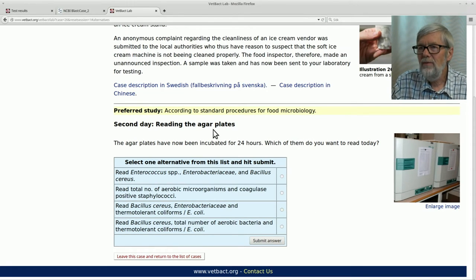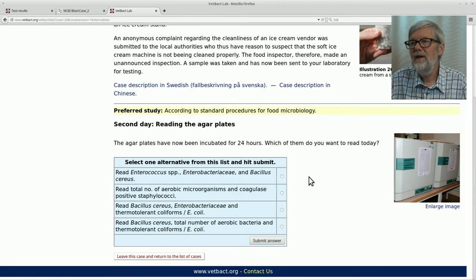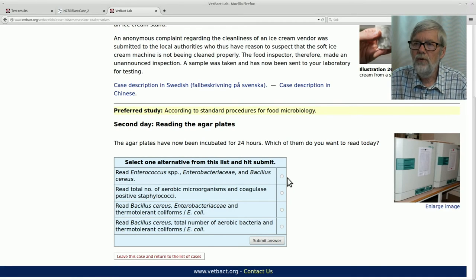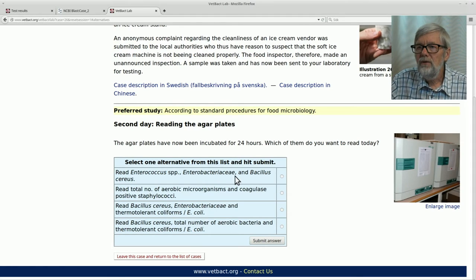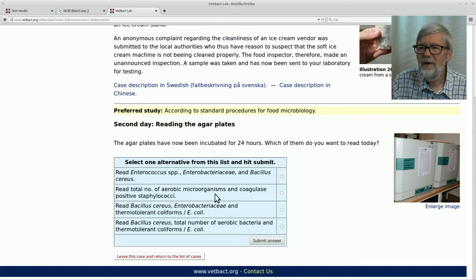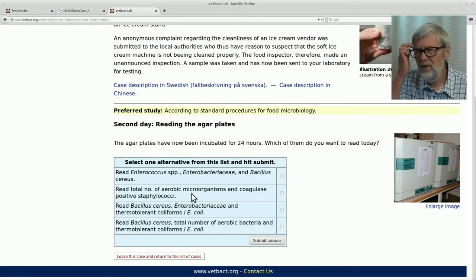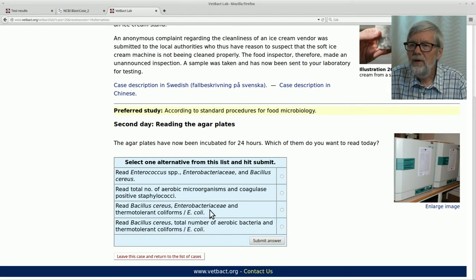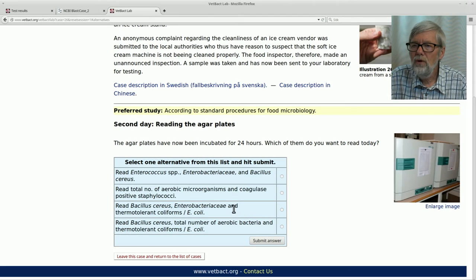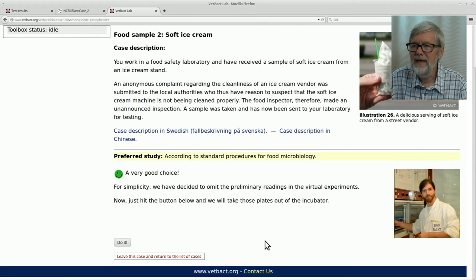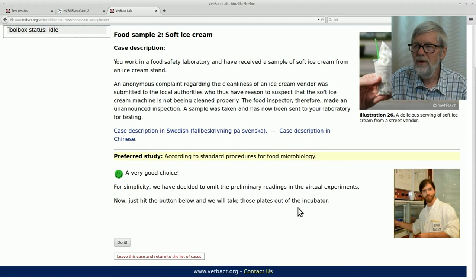Now we have incubated the plates for 24 hours — we are already on the second day. The question is which bacteria should be read after 24 hours. Not enterococci — we weren't analyzing that parameter. Aerobic microorganisms and coagulase-positive staphylococci need a longer time. Bacillus cereus, Enterobacteriaceae, and the coliforms should be analyzed after 24 hours. Let's submit the answer — yes, it was correct.